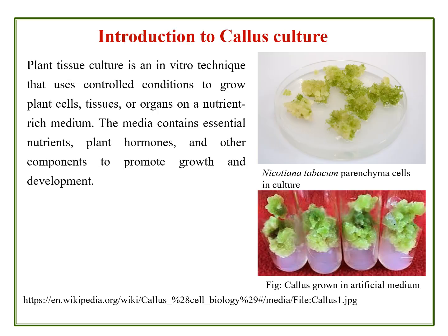First of all, what is callus culture? So plant tissue culture is an in vitro technique that is carried out within glass or within laboratory conditions, that means aseptic conditions. Every time, in vitro means you have to maintain aseptic conditions where the plant cell can survive and sustain, establish itself, and offer a variety of scalable products from the callus tissue.